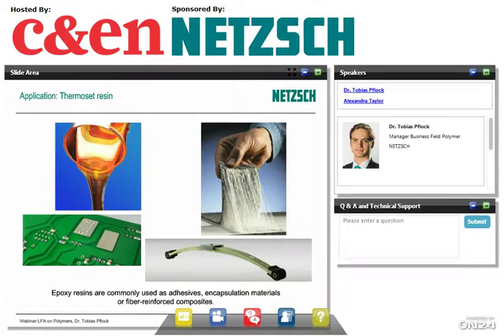So two things, encapsulation materials in electronics. Well, that's a very prominent example where you want to adjust your thermal conductivity, because that's a typical example where you have some kind of integrated circuit that is just sitting underneath your encapsulation, and you want to get rid of the heat. So you have to adjust the thermal conductivity of your encapsulation material. And this is obviously what is being done. So you can buy these epoxy resins with different kinds of conductivities.